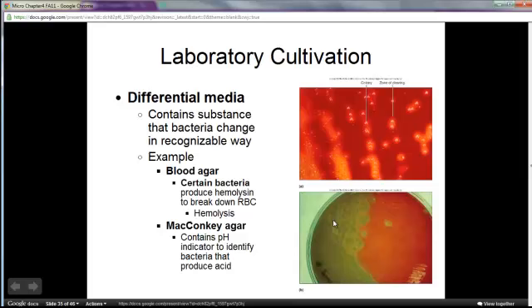And coliforms traditionally are going to produce acids on MacConkey, which is going to cause this color. So again, if you think a sample may be fecally contaminated, or you think that blood may have fecal contaminants in it, you could grow those samples up on MacConkey agar, try to witness this change in color, which would then indicate that indeed there is some fecal contamination occurring.